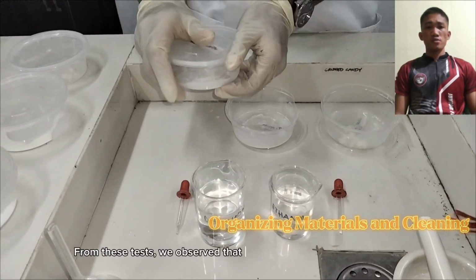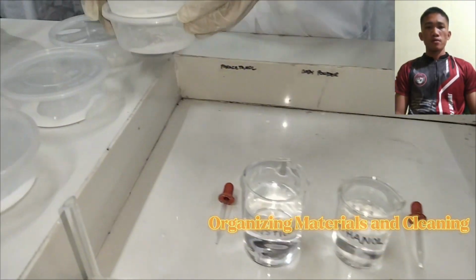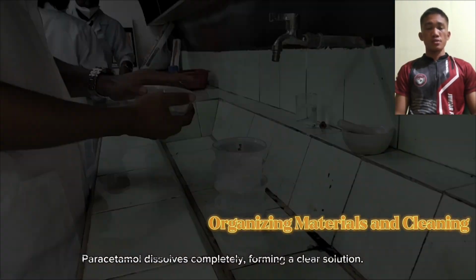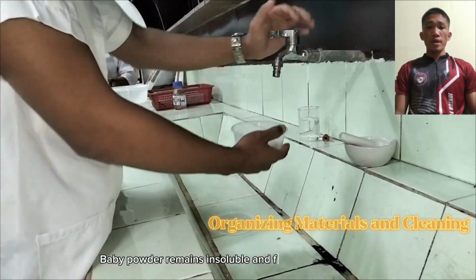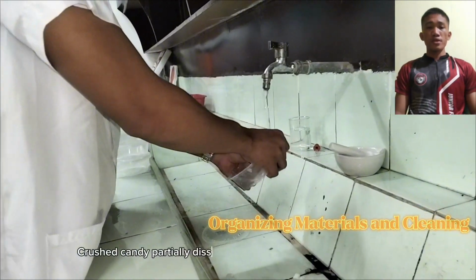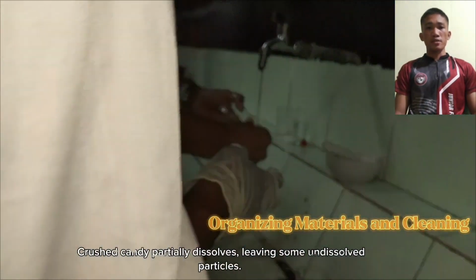From this test, we observed that different adulterants react differently with ethanol. First, paracetamol dissolves completely, forming a clear solution. Second, baby powder remains insoluble and forms clumps. And the third is crushed candy, which partially dissolves, leaving some undissolved particles.